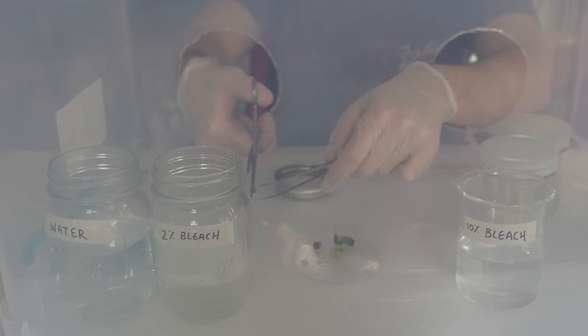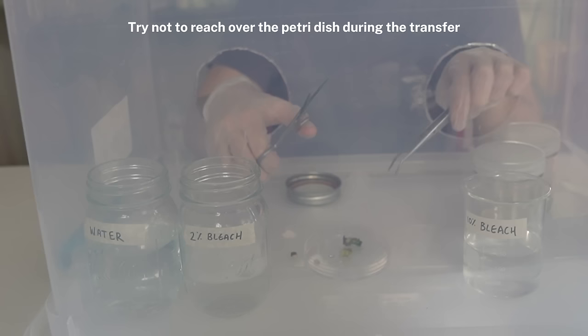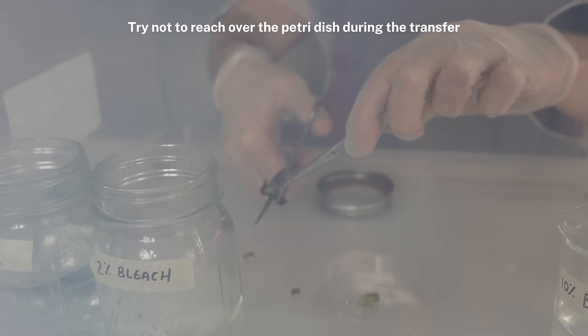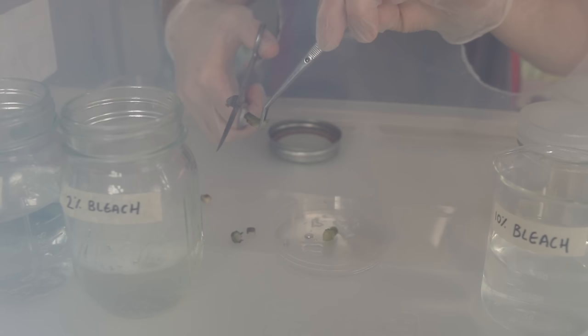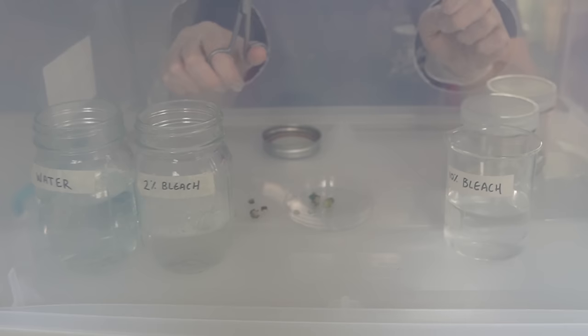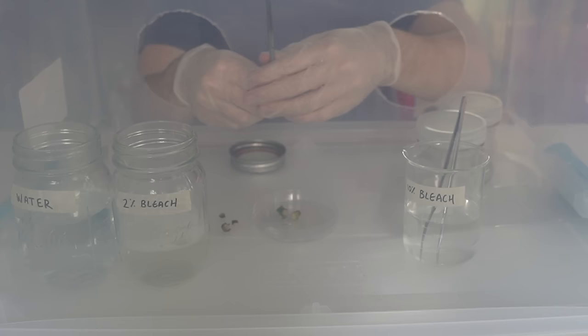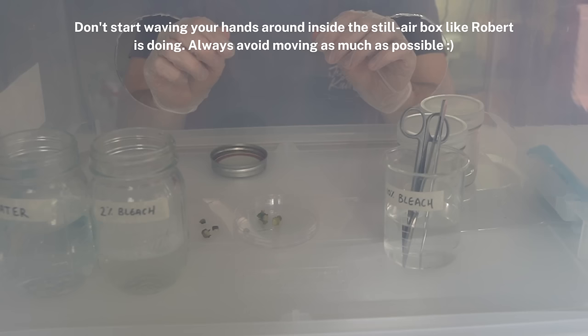Before doing the next explant, dip both tools back into the 10% bleach to keep things as sterile as possible, then do the same thing to the other explant. We're trimming the ends because the tissue there is going to die since it's been in bleach — we want to avoid putting dead tissue into tissue culture. Also, avoid putting your hands over the top of the petri dish so you don't get any dead skin or germs falling onto it, since the dishes were gamma-irradiated and purchased pre-sterilized.